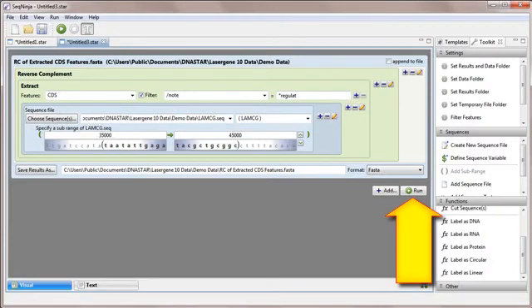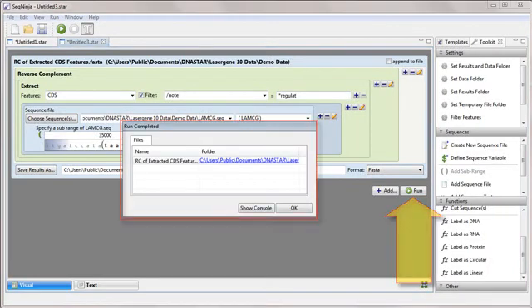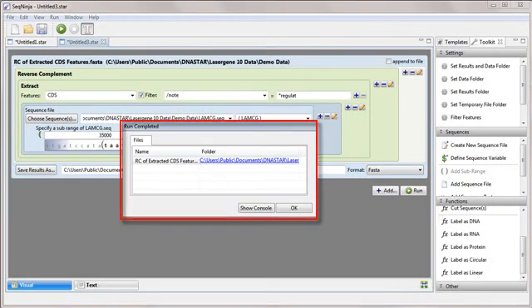To run the program, click the Run button. Once the run finishes, the Run Completed message box appears with a link to the Results folder.